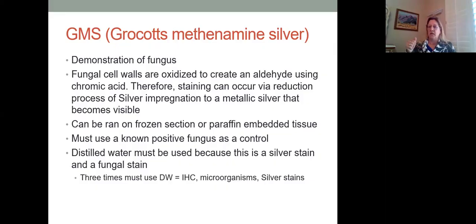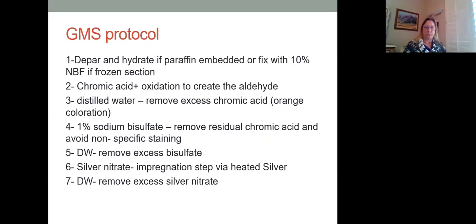And again, distilled water, right? I'll reiterate it again, the 3 times you have to use distilled water: immunohistochemistries, microorganisms, and silver stains. And this stain is 2 of those. It's a microorganism and a silver stain. So you have to use distilled water.